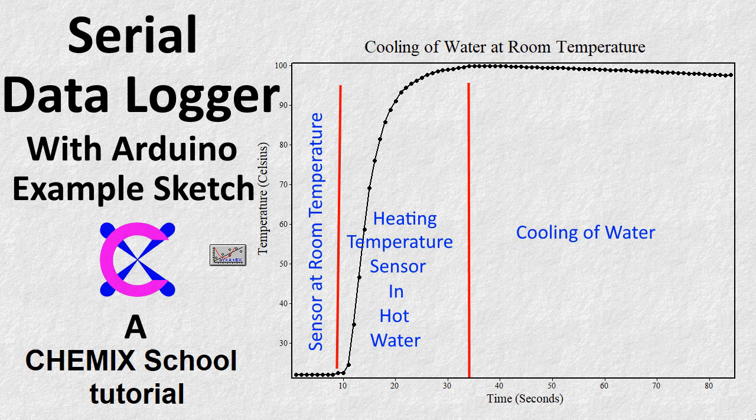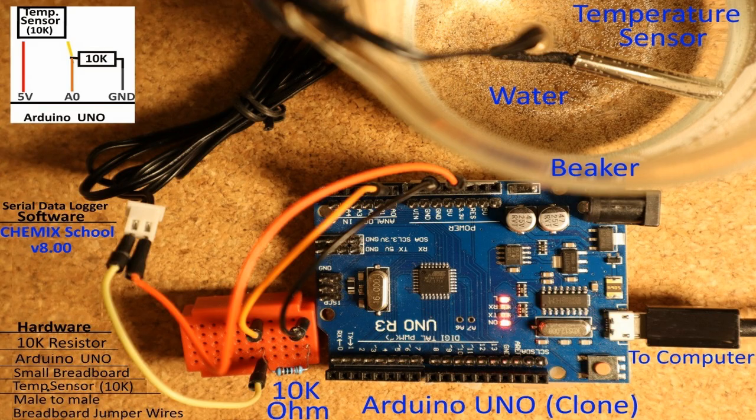For the data acquisition, we will also need a microcontroller — in this case, an Arduino Uno or a compatible clone. As the sketch already contains a simulation of the experiment, we only need the microcontroller and the downloadable sketch, plus the Chemex School software and the Arduino IDE software.